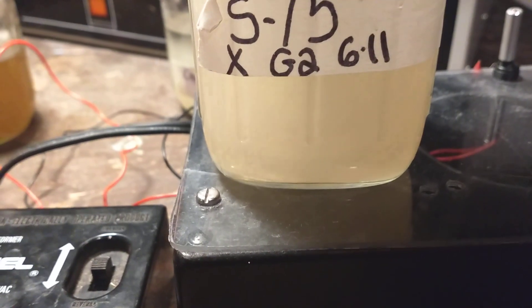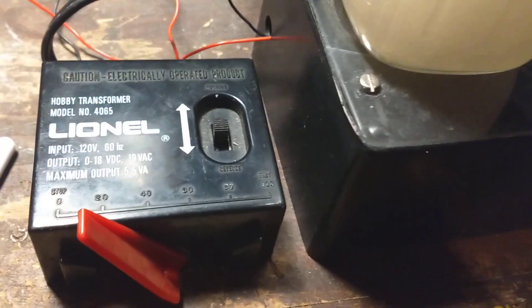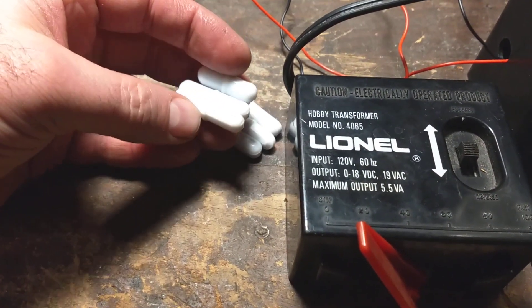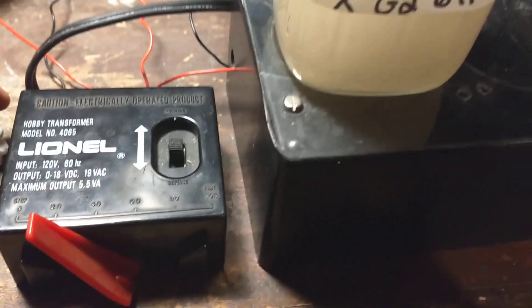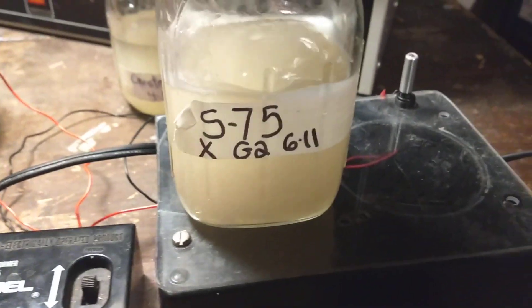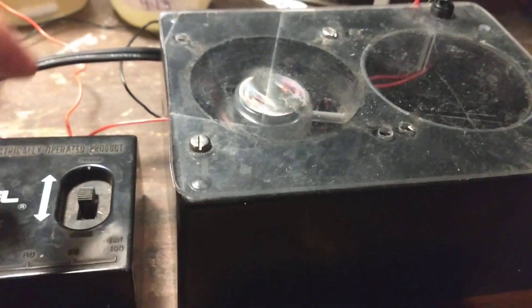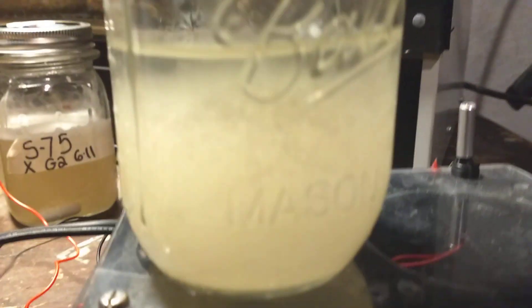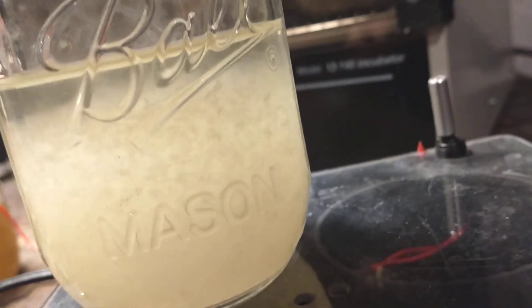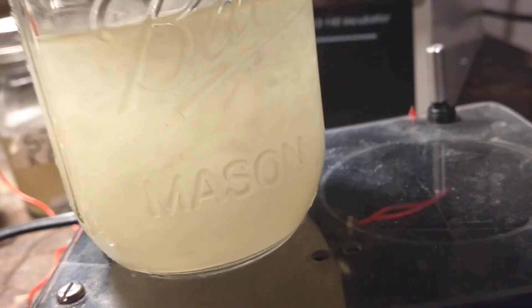Pretty cool. I had all the stuff laying around, so I didn't have to go to the store and buy anything. The only thing I had to order were the magnetic stirrer bars, and they're not that expensive, especially if you get six or eight at a time. So that's it. I have a little shiitake S75 culture going in there, and I've got some chestnut mushrooms in there too. You've got to turn it off before you put another one on it for some reason. Have a nice day.